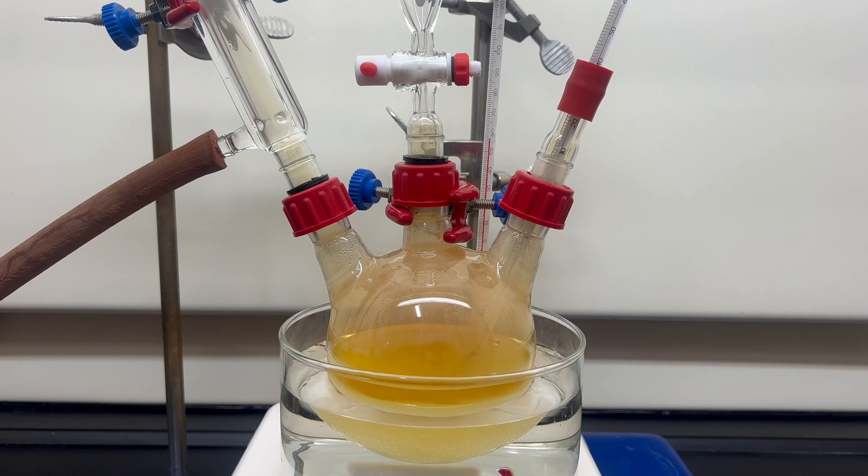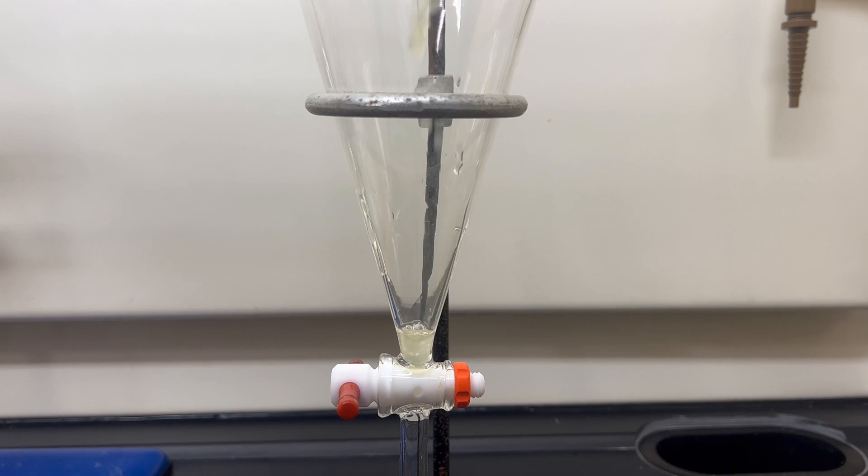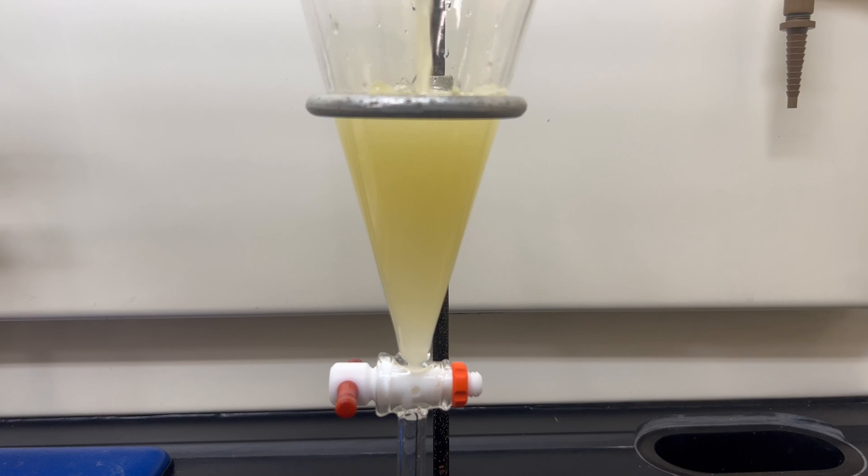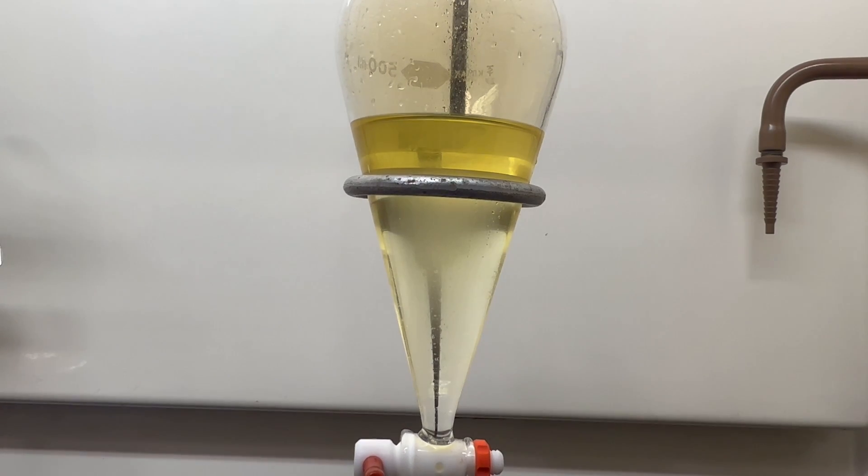At the end of an hour of reflux, the flask is allowed to cool to room temperature. Once cool, the contents are then transferred to a separatory funnel. The bottom layer contains acid and the top is nitrobenzene.